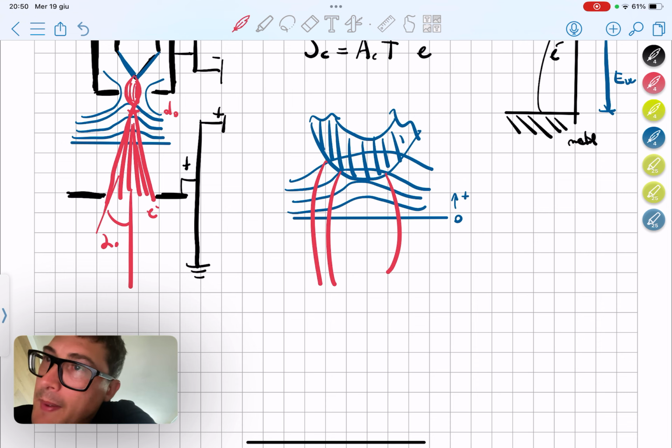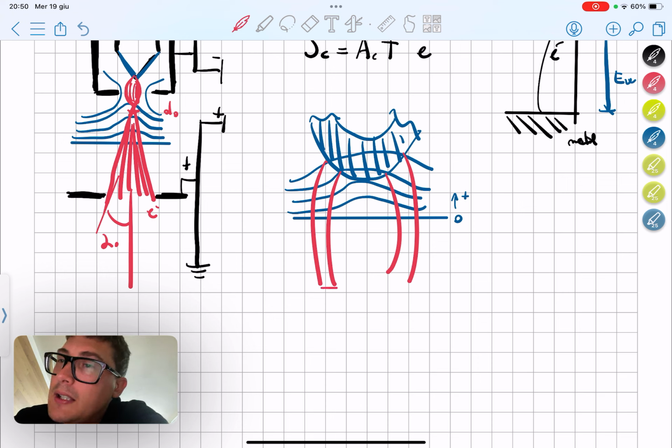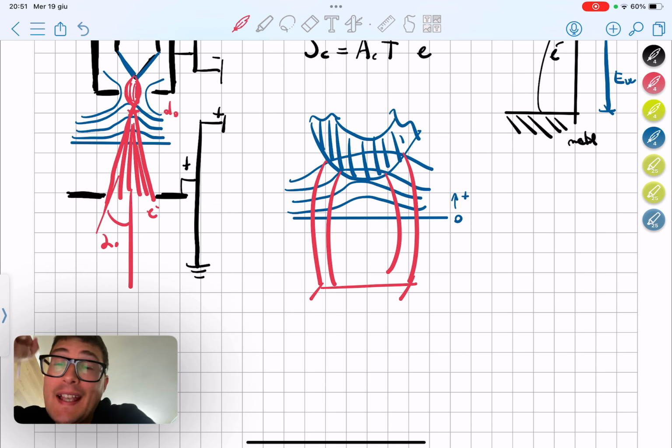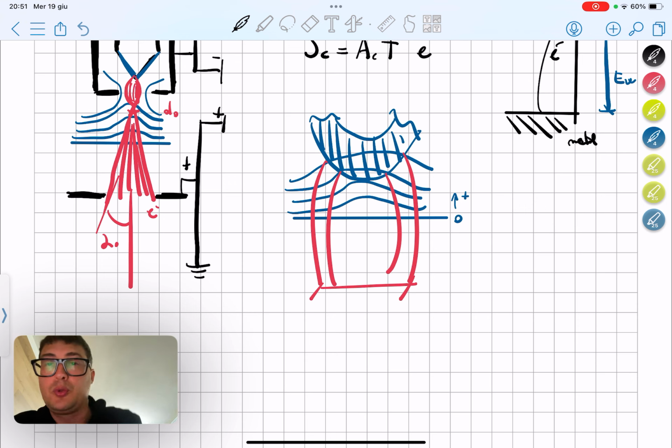because if we go too much deeper, the beam size will be big, and maybe you can think that this is a good thing, but actually it is not that good, because if we have this spot size, we will need a lot of effort to be paid with the lenses in order to condense the beam, because the best will be to have a small spot size. So if the extraction is too much, we will need to work a lot with the lenses in order to converge the beam to make it smaller.